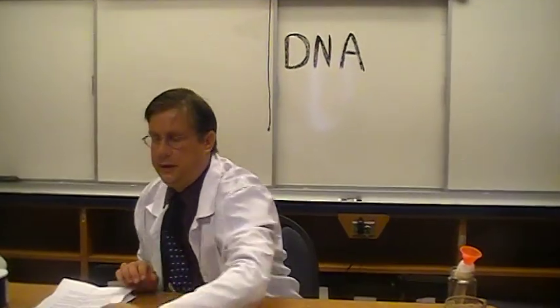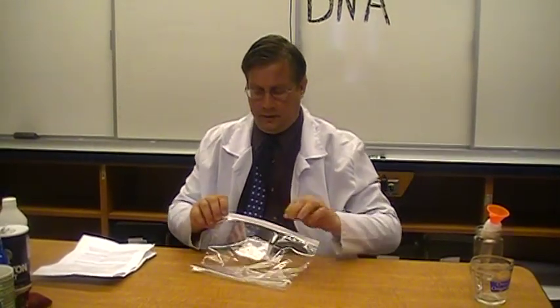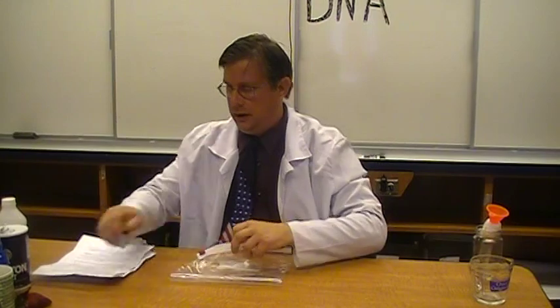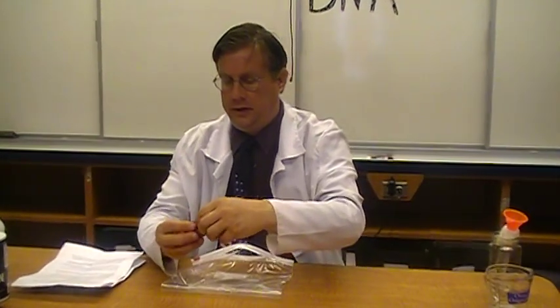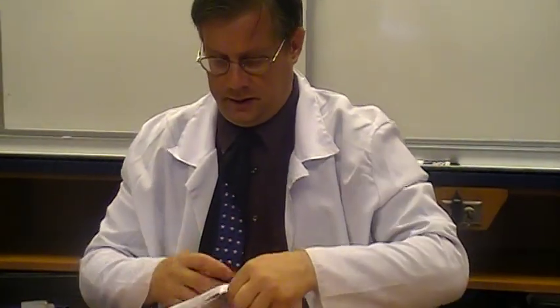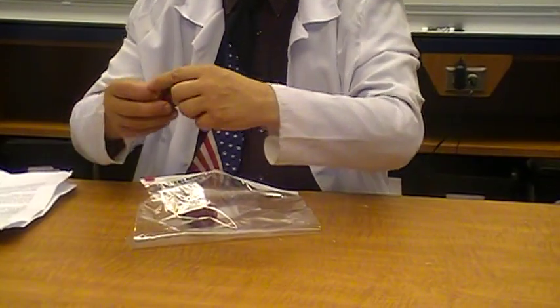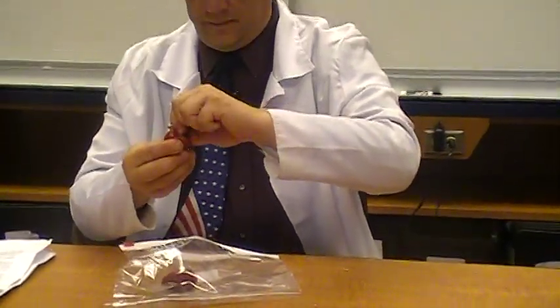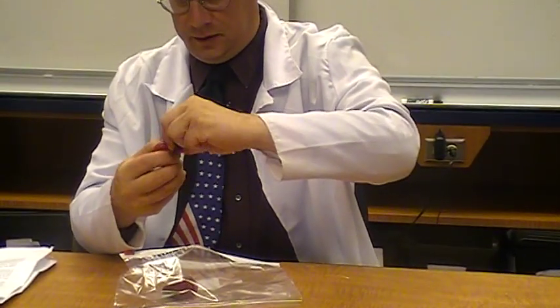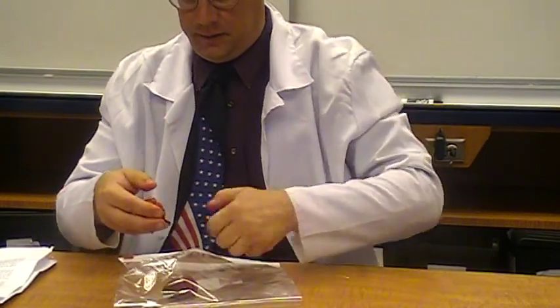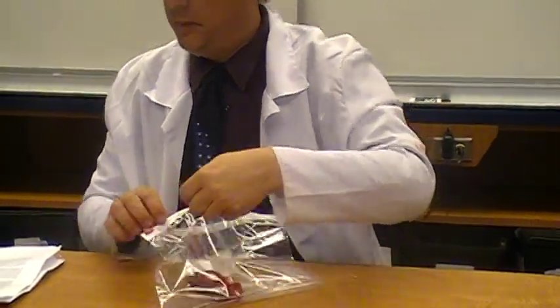Okay, the first thing I need to do is I need to take out my Ziploc bag, and I'm going to add to it a couple of strawberries. I'm going to pinch off the green part of both of them, just like so. These are really mushy strawberries, which is good. The mushier the better.